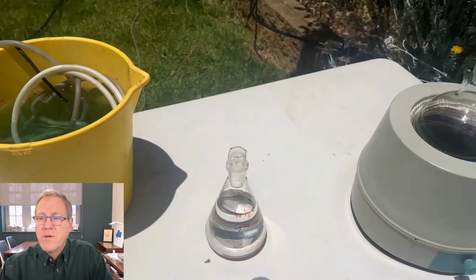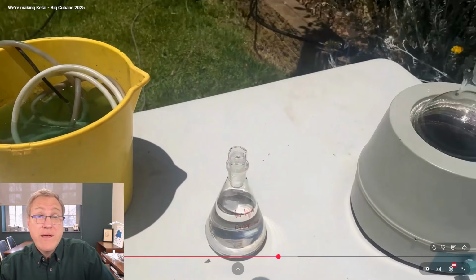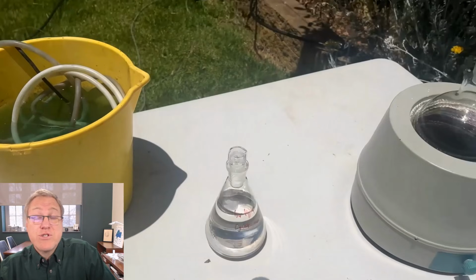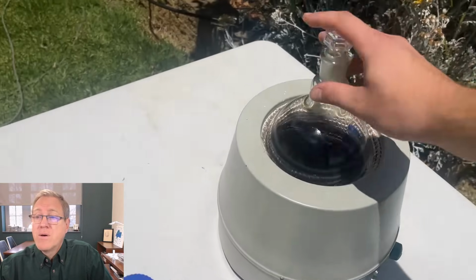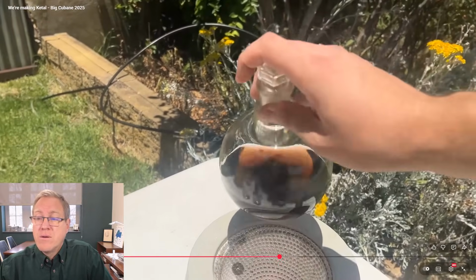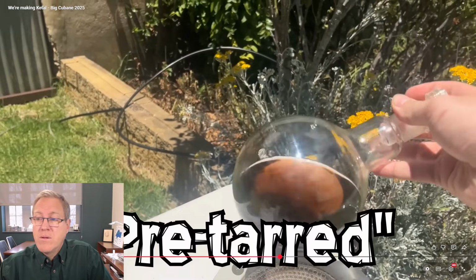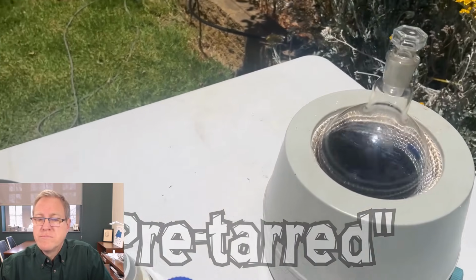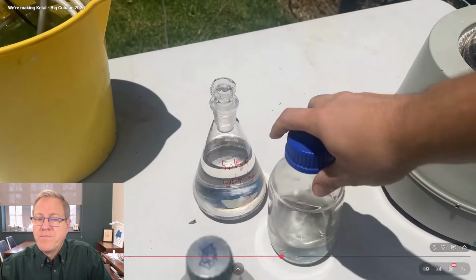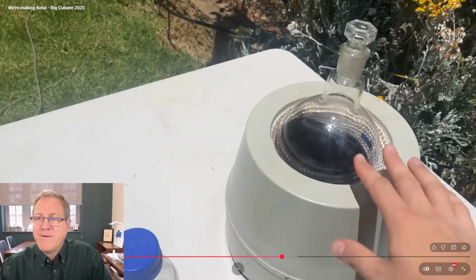It's been sitting in the sun. So that's the material he just made in the first half of the video, to which I'm not reacting right now. Could move that out. Ethylene glycol, and we got our toluene and our sulfuric acid mix, which has kind of been pre-tarred, let's say. Pre-tarred? I know, maybe that's not a good word. It sounded better in my head.